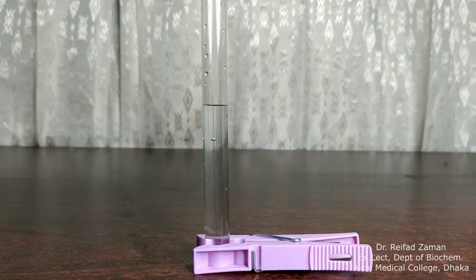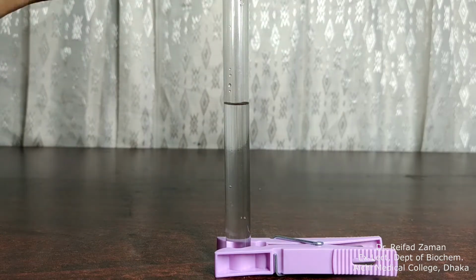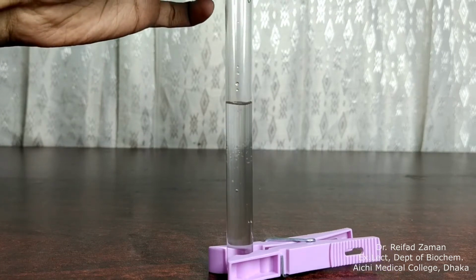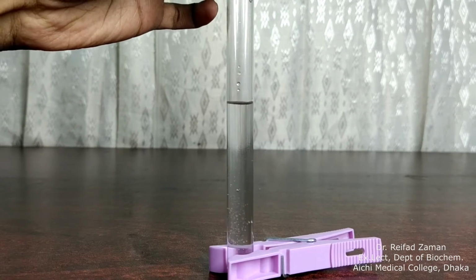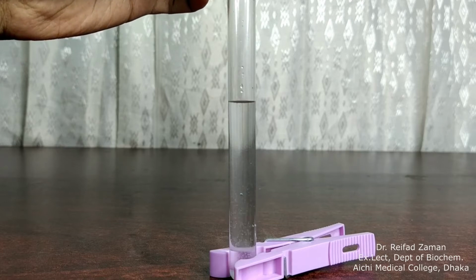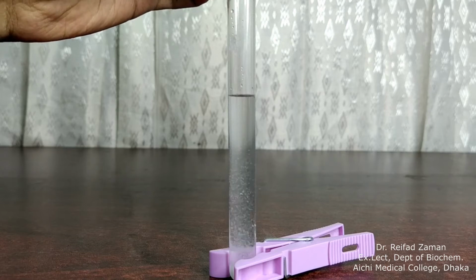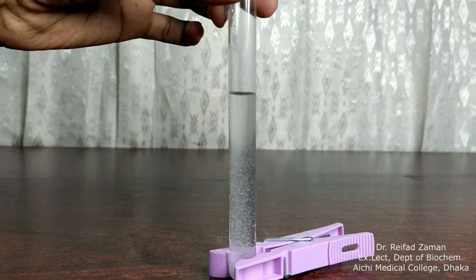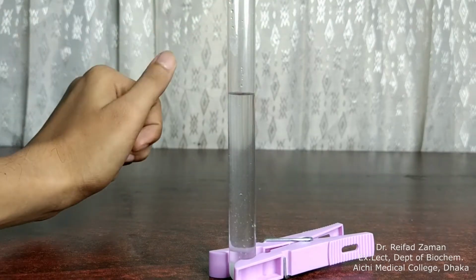So let's start this experiment. We have a test tube full of water, just simple water. For the first experiment, we are going to create a solution. So now let's add some salt. Okay, I think that's enough.